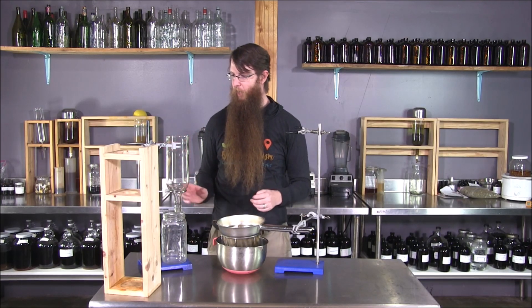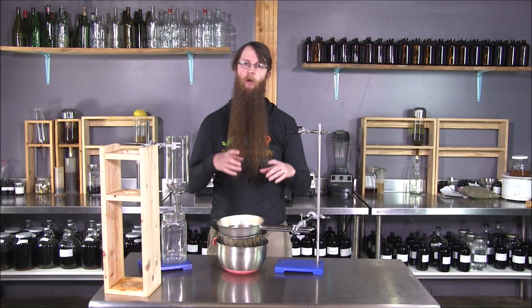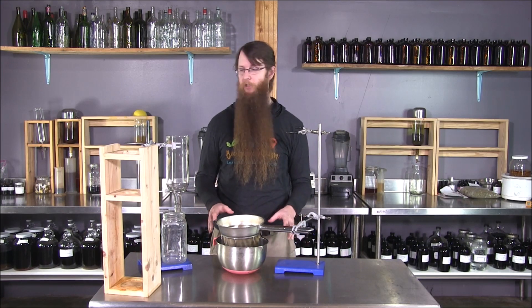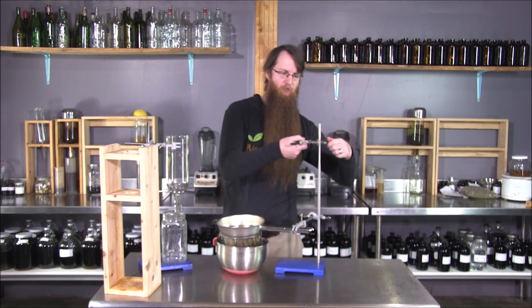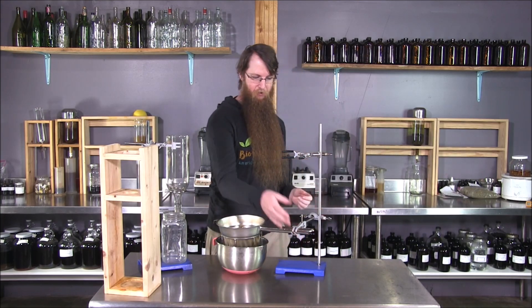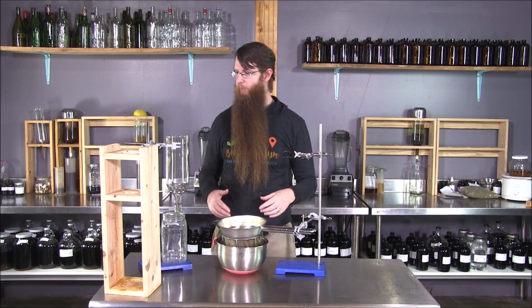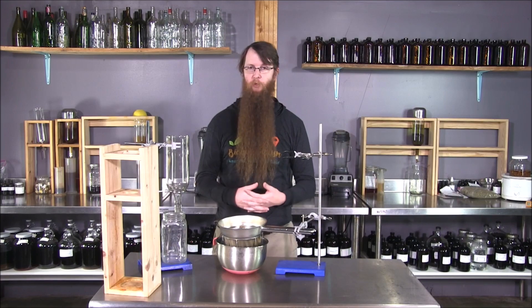You can use it as a percolation cone stand, and if you're going to use glassware it's essential to have a couple of lab stands to hold all of the pieces so they don't risk coming apart and breaking. For $30 they're really easy and have a wide range of uses, and I encourage you if you're going to be making a lot of medicine to play around with some laboratory equipment. There are different types of barette clamps — this triple clamp is a little bit tighter than the other clamp, and it's an add-on that doesn't come with the kit. There are also a lot of additional pieces; you can put bars between and hang clamps off for glassware setups, as you might have seen in our vacuum distillation video. Start playing with them and I hope you enjoy them as much as I do.